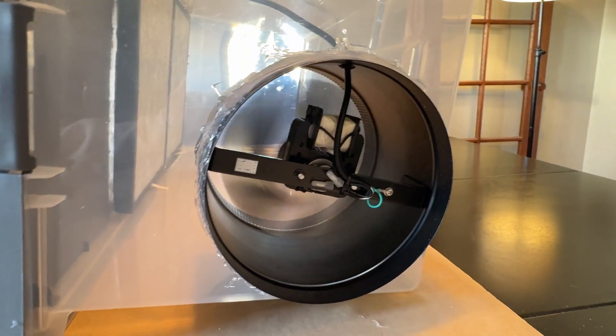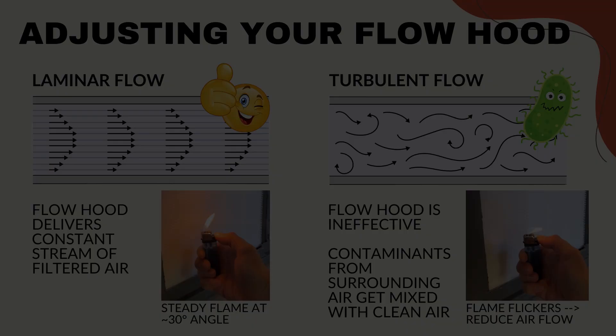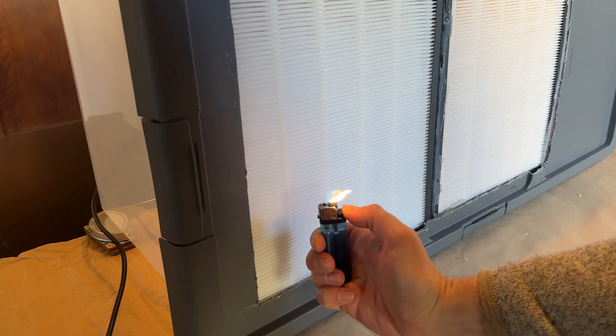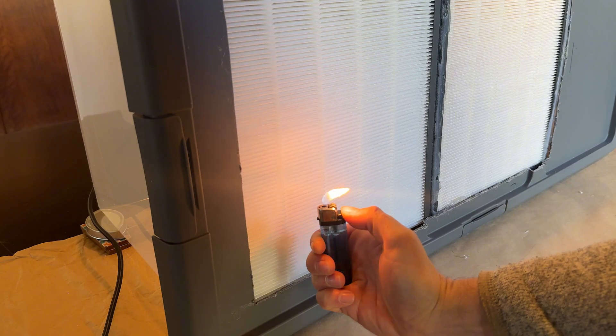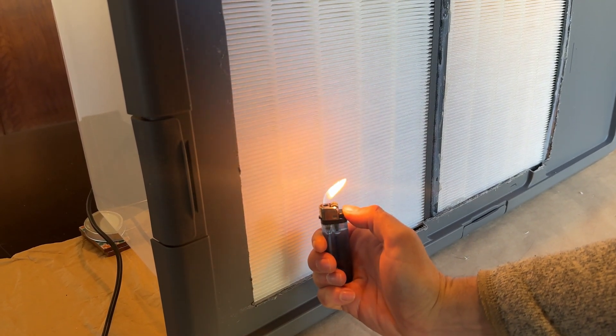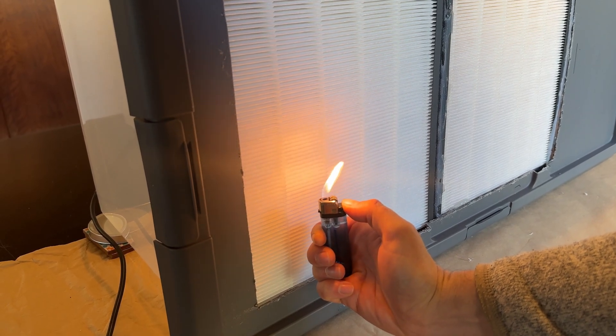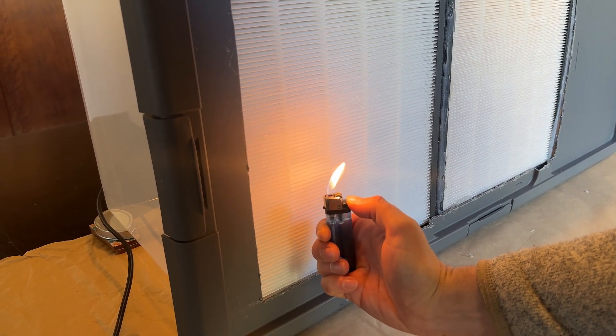The last thing we'll need to do is adjust the fan speed and make sure that the flow hood produces laminar flow and not turbulent flow. We can easily check that by using a lighter and holding it close to the filter. See the flickering? That means the fan speed is too strong and the flow hood will produce turbulent flow. Dial it back a little bit to get a steady flame and contaminant-free airflow.